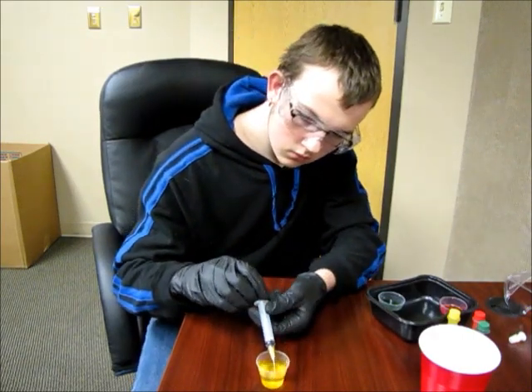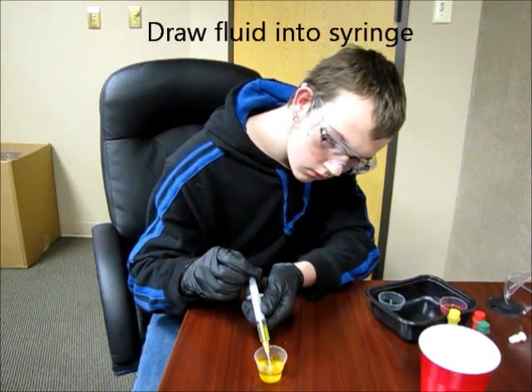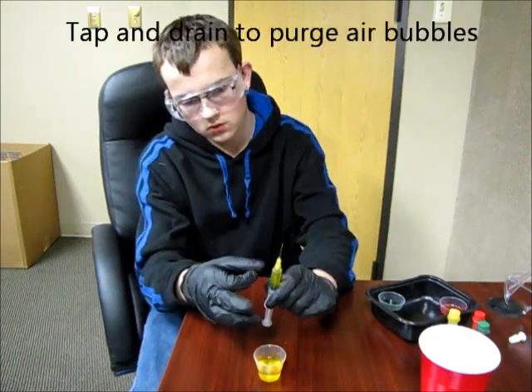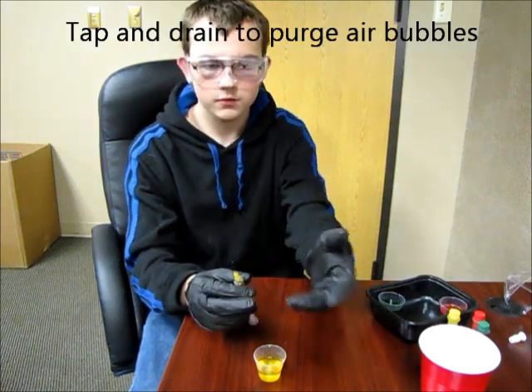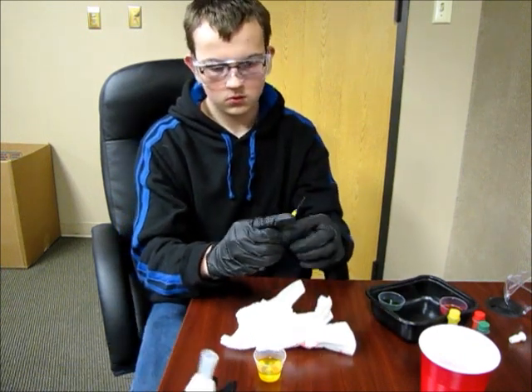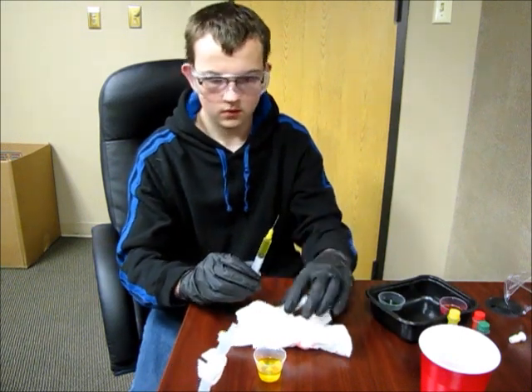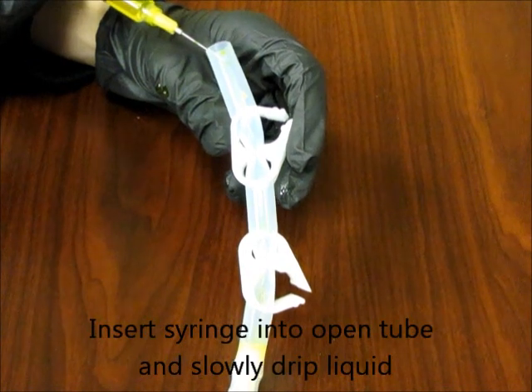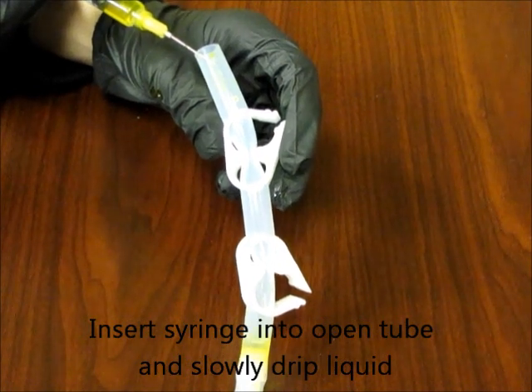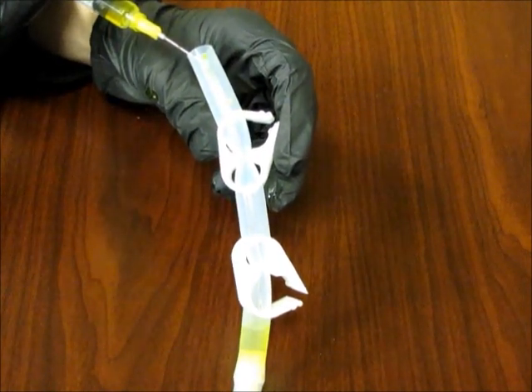To put the first fluid into the tube, begin by drawing the fluid into the syringe as shown. Tap the syringe and purge it of any air bubbles that might be in there. You may then insert the syringe into the tube and slowly drip the liquid along the sides of the tube so that it drops down into the first chamber.